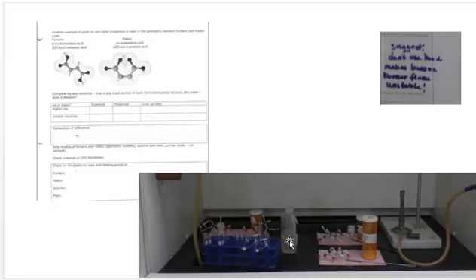After they cool, add a few drops of water and see about their solubility. Polar compounds should be more soluble, and actually the polar compound should have higher melting points, but I think in this case there's a lot of what we call steric hindrance and perhaps has a lower melting point.